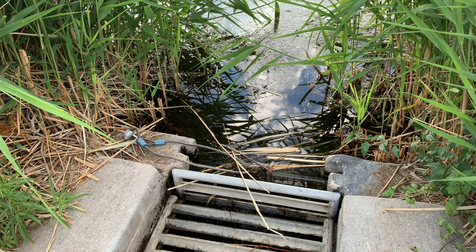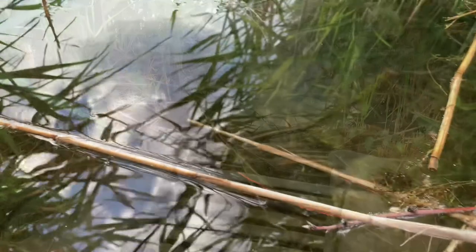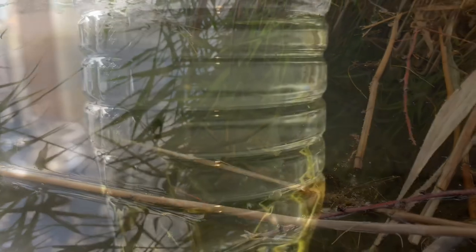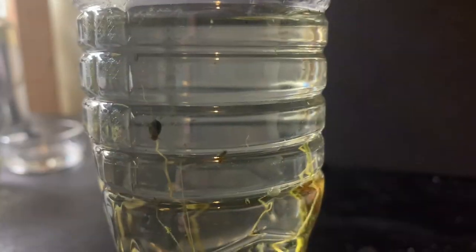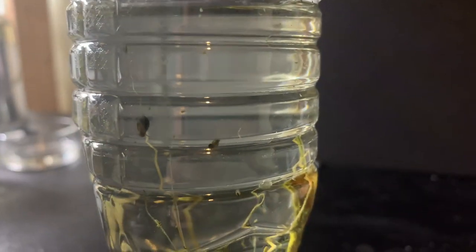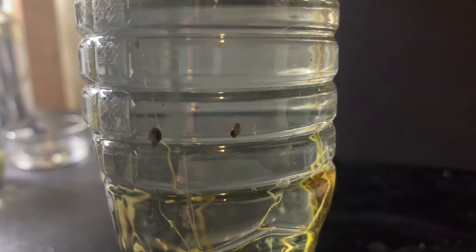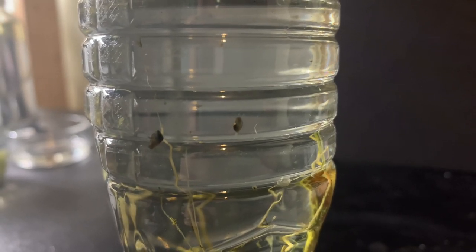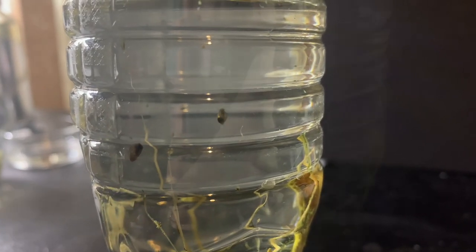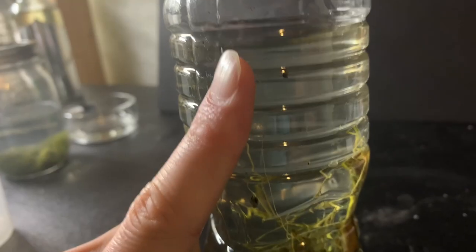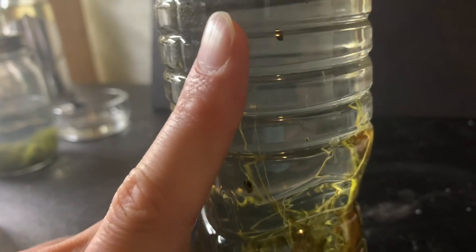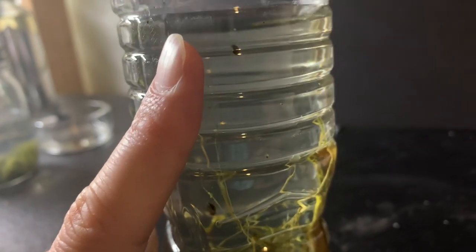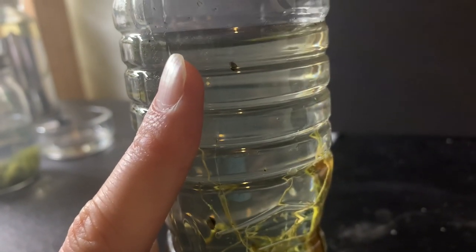So that is exactly what I did and I am lucky that I did because we got some really cool stuff to look at. Today we are going to be examining two different organisms: these snails here and some planarians that we found as well.